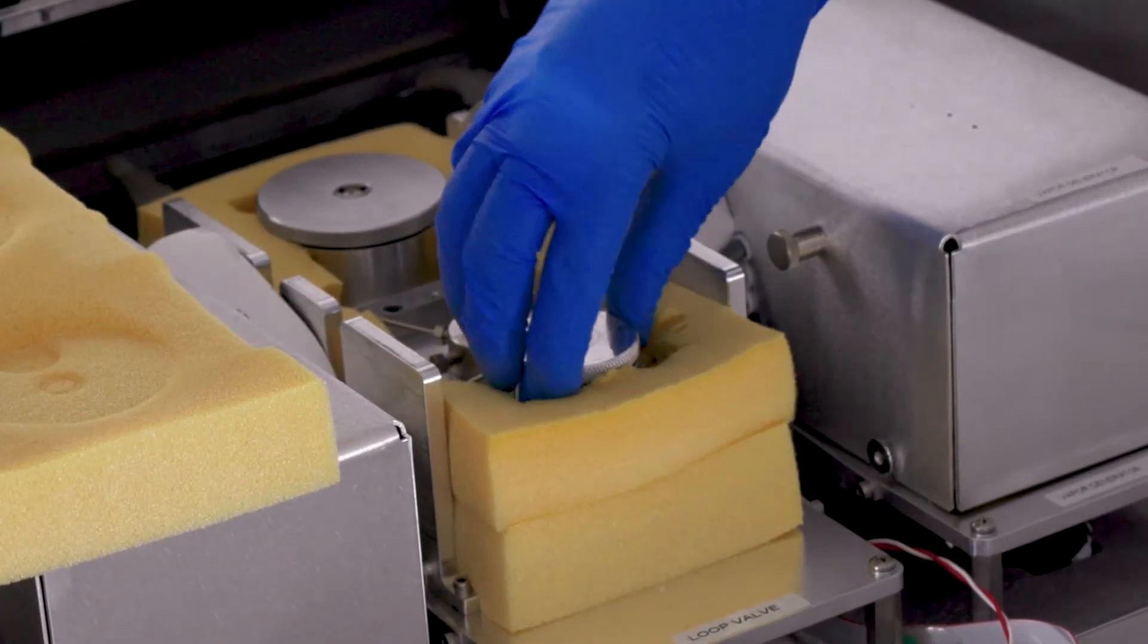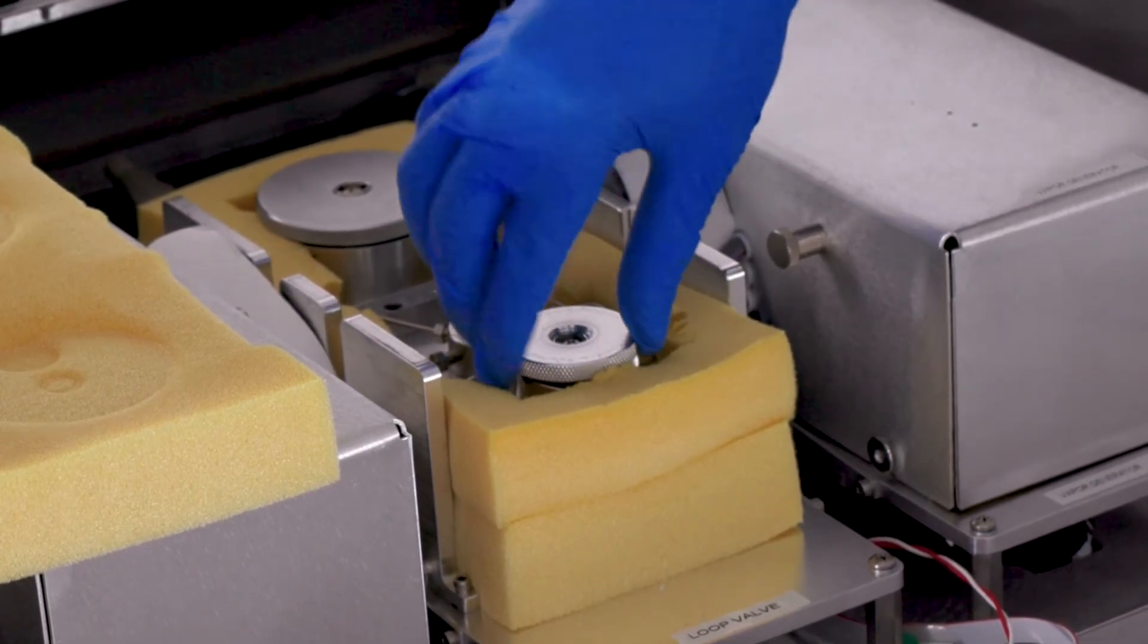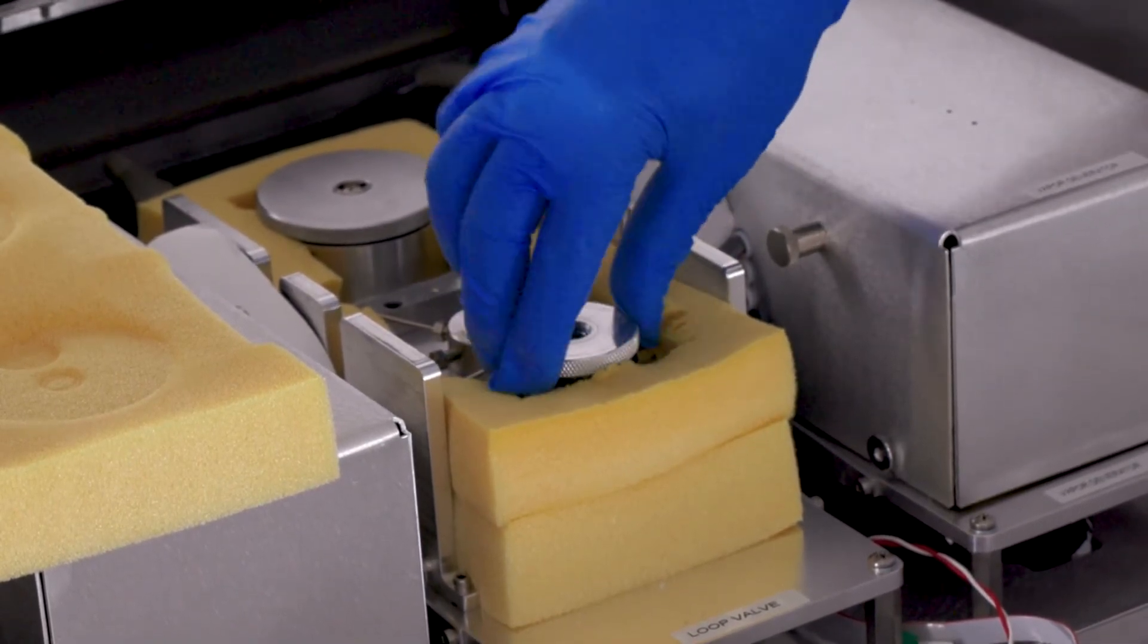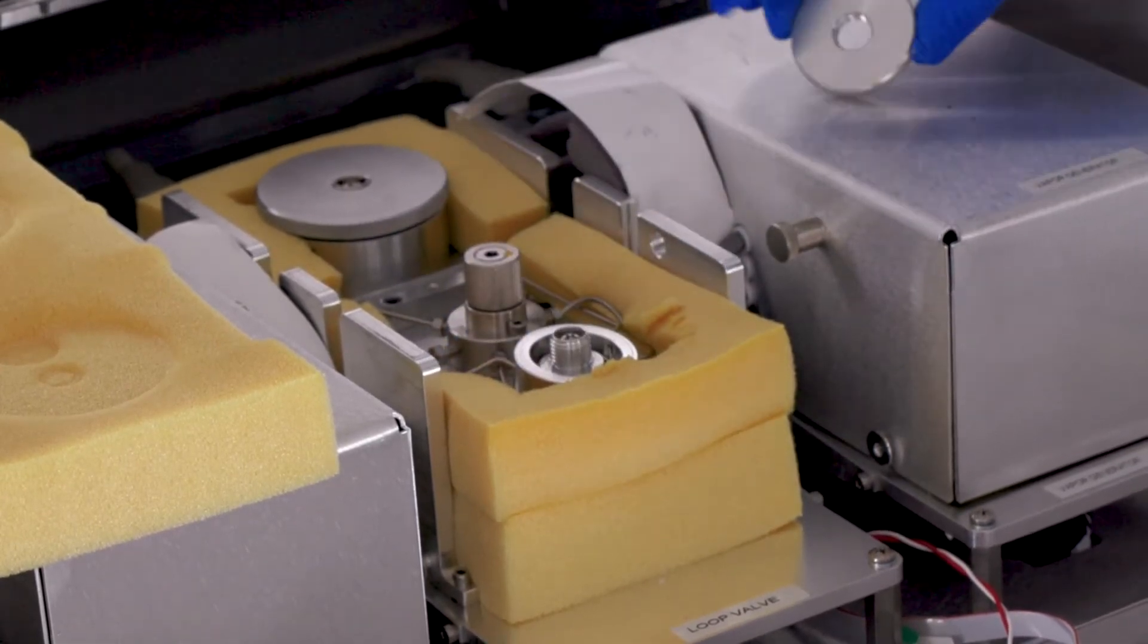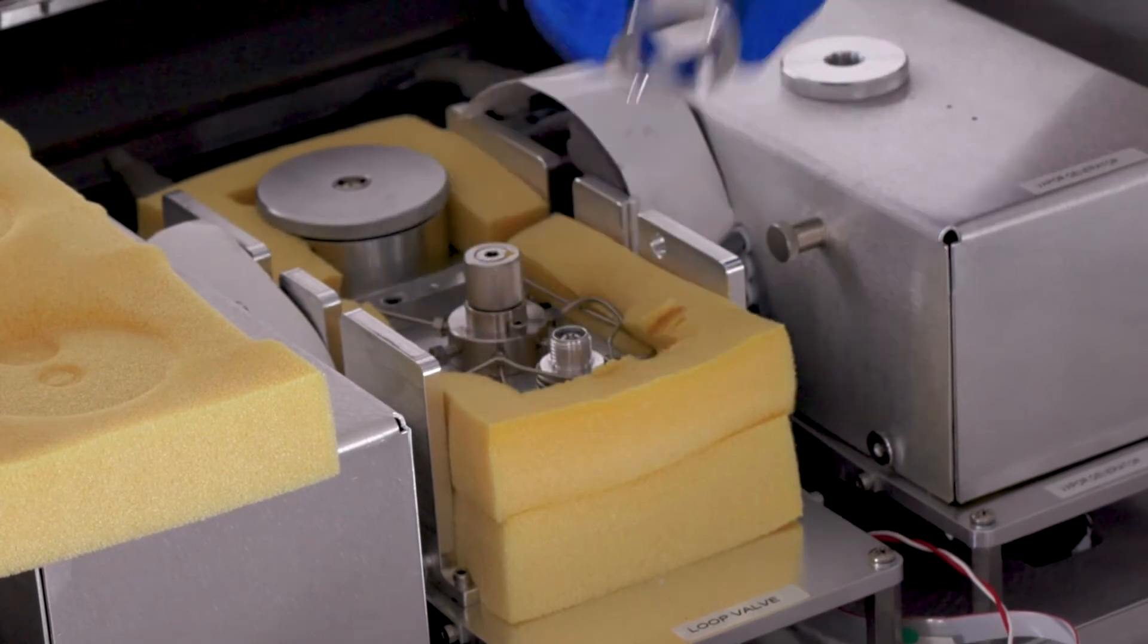Unscrew the top nut of the enclosure and place it aside. It may be necessary to loosen the screw in the middle of the assembly to free the nut. Remove the enclosure ring by lifting it up.